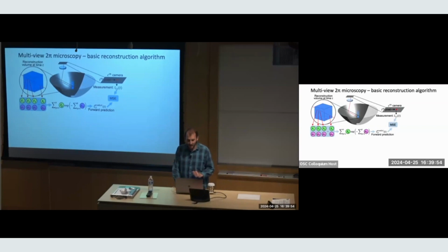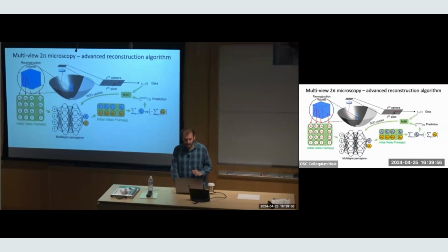But we actually figured out a better way to do this, which is to use a neural network. Some of the other results I showed, I didn't get time to really talk about. For example, the 3D ant imaging: we're also using an untrained neural network in that approach for some of those results. We've been adopting this approach more and more for our different imaging applications.